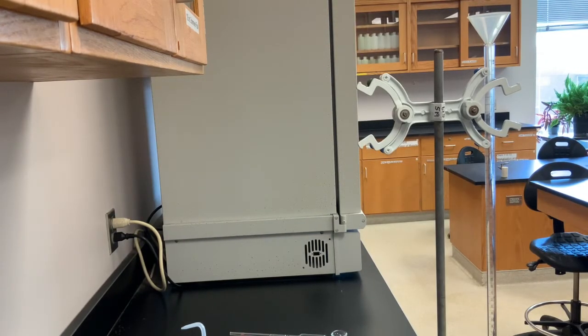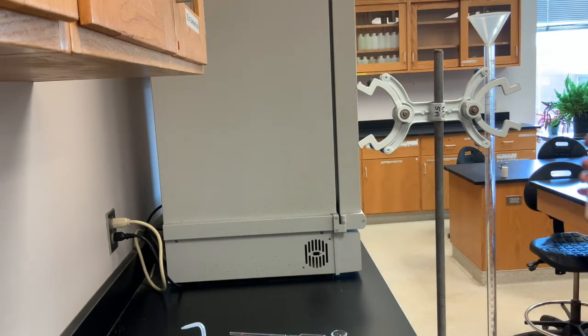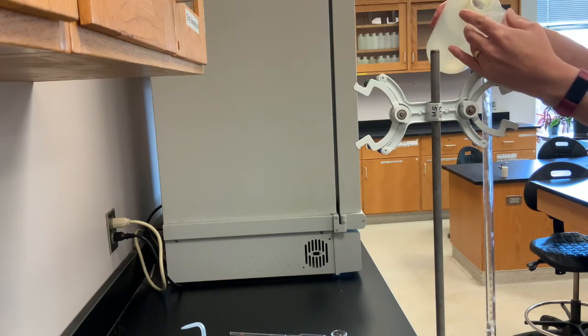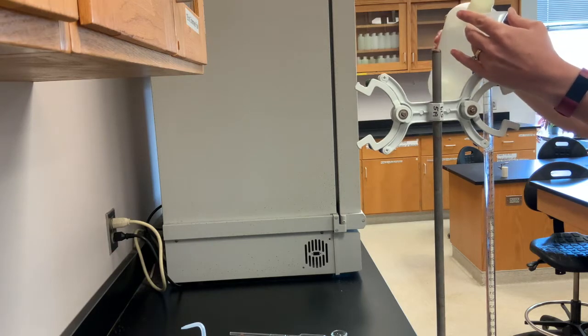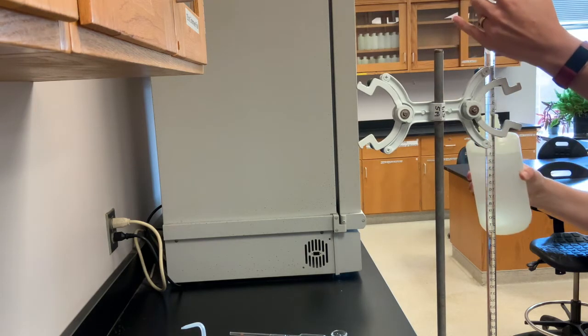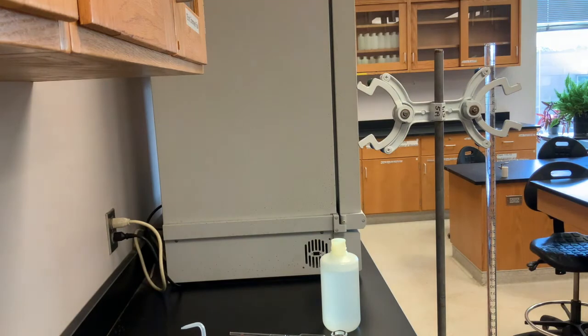So now that our burette is set up, attached to our burette clamp, and we've cleaned and conditioned it, we're ready to add our sodium hydroxide. We want to make sure that the burette is eye level, and we've got a funnel in the top, and we're going to pour our sodium hydroxide into that burette until we get to our 0 milliliter mark. When we're using funnels, we've got to be careful because that liquid can come out a lot quicker than we realized. So I'm above the zero mark now.